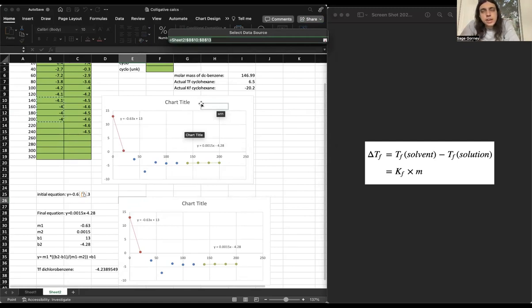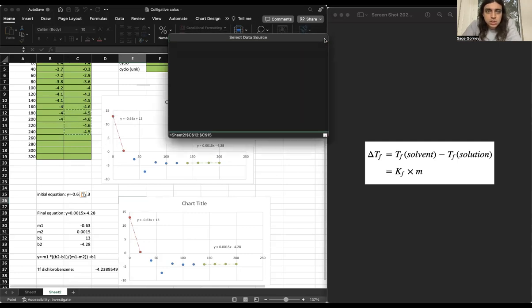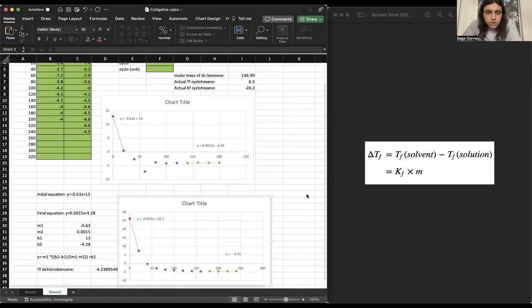And I think we quantified that as a change of no more than 0.4 degrees Celsius. So you can just stop there, wherever that is in your data, but I'm just doing the last 4 data points here. Let's see, if I do okay, does it change it? Yep, now we're all changed.